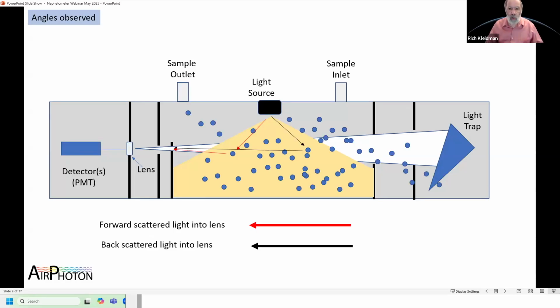So if I'm now filling this chamber with particles and I've got my light source on and I'm illuminating the whole chamber, follow the beam of the light and how it interacts with the particle and then is intercepted by the detector.